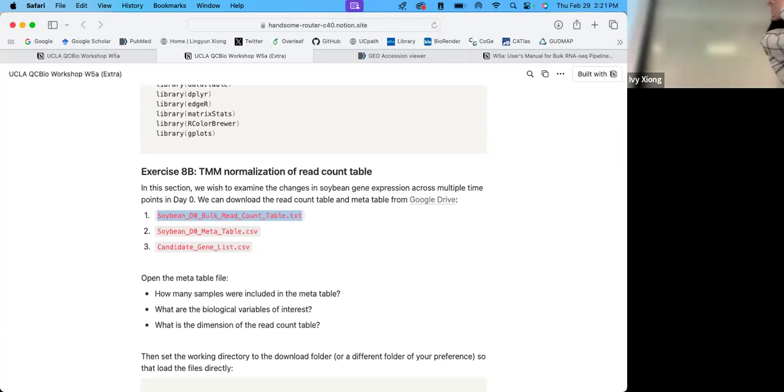One of the errors says it needs C++. So you'll have to activate it or try to find it on your local laptop. Right, it says you need the C++. So now you're installing the source package.